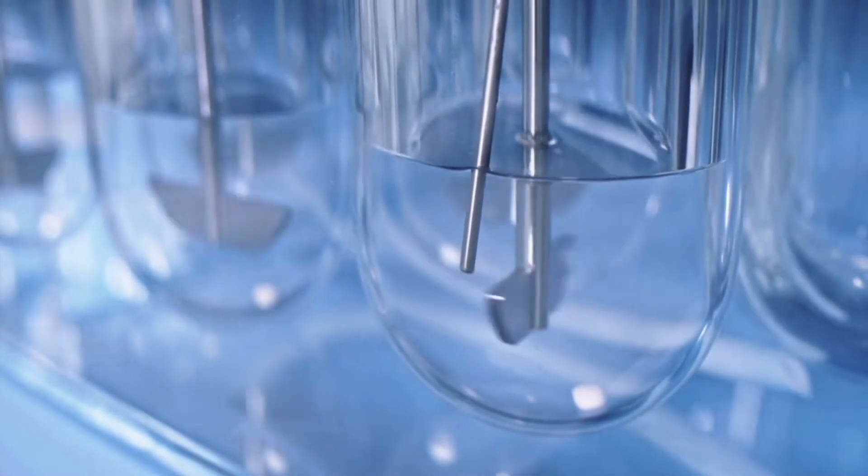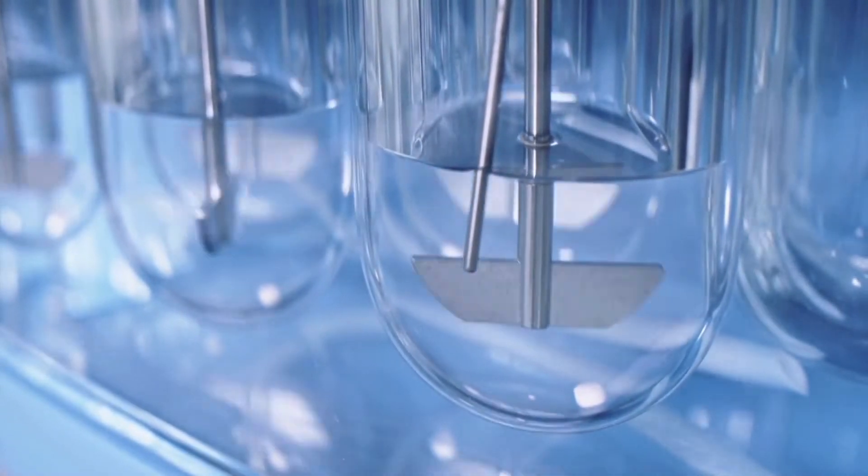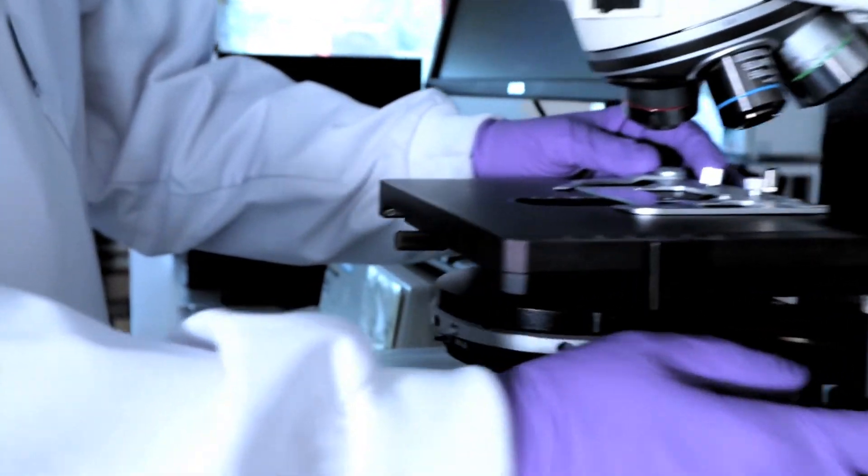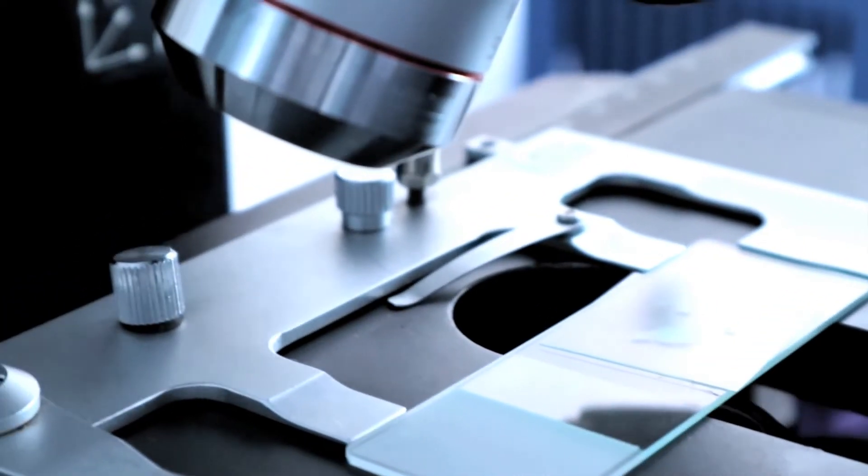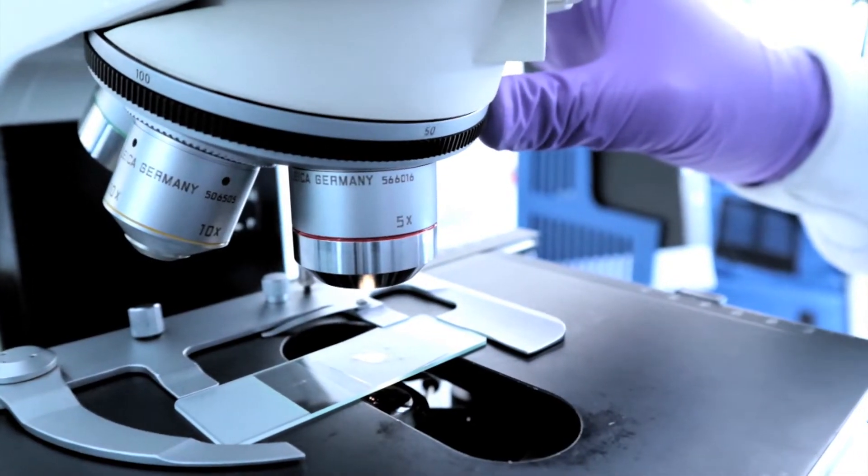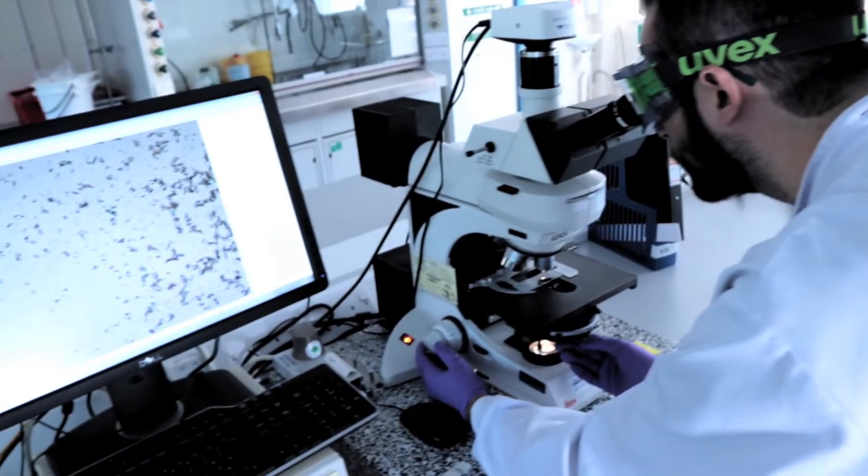Our milling capabilities are underpinned by our world-leading solid form services under the Phyrmorphix brand. This allows us to investigate the micronised material, analysing the dissolution rate and providing a full characterisation package on the milled material to confirm that it is a technique suitable for your API.